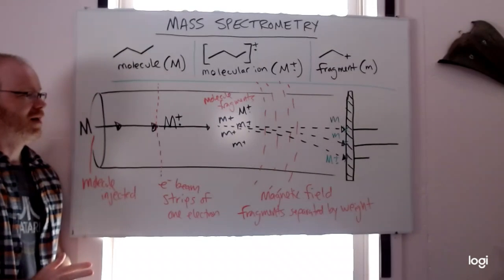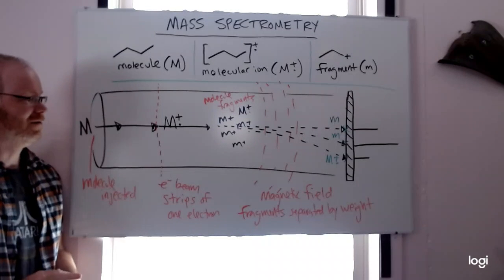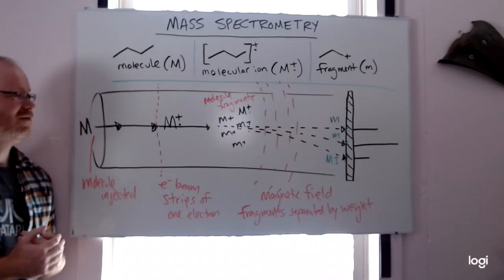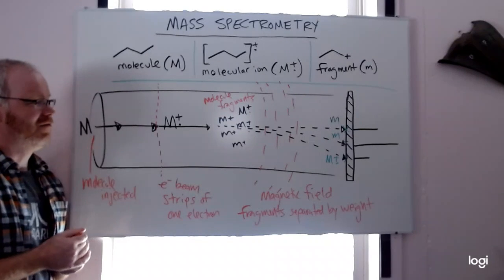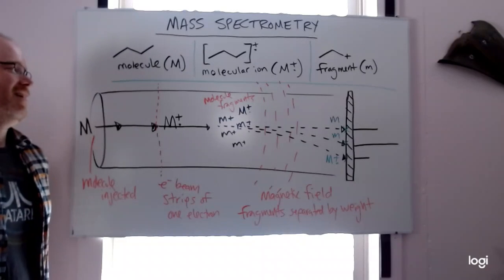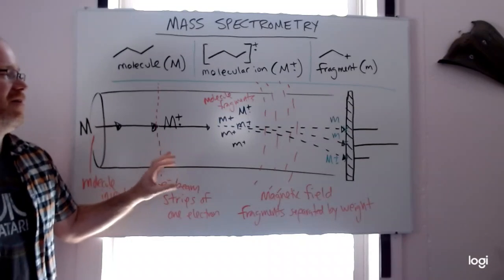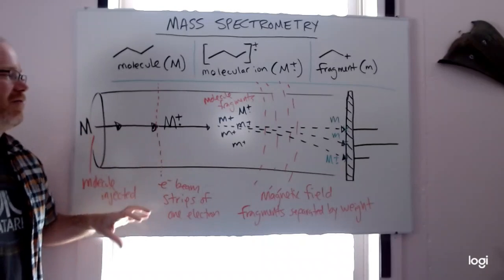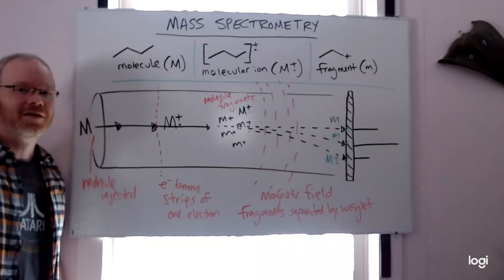It works a little bit like a molecular fingerprint, and relatedly can be used to detect those molecules by comparing it to known spectra. Mass spectrometry, for that reason, is used a lot in things like drug testing and forensics, because you can detect molecules with only very, very small amounts, and they each give distinctive spectrum patterns that are really helpful in figuring out what you've got.